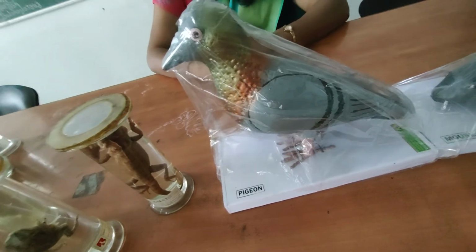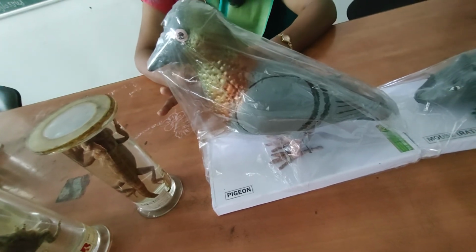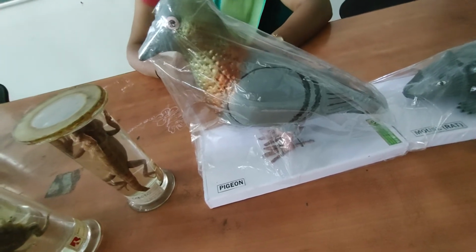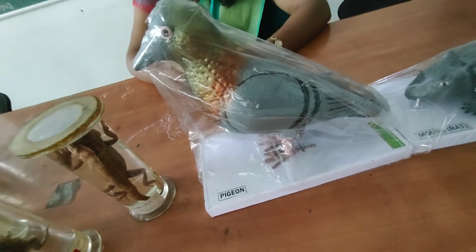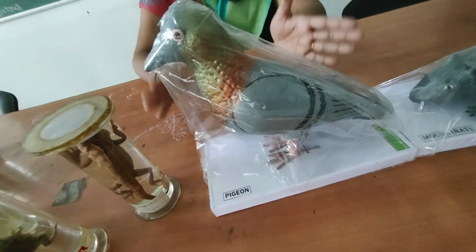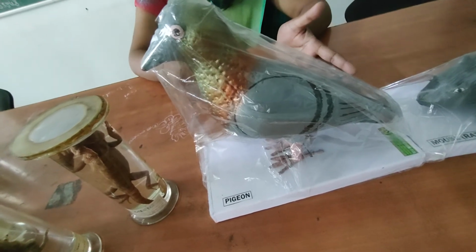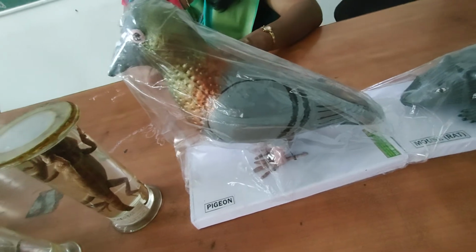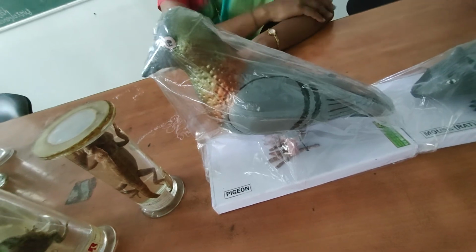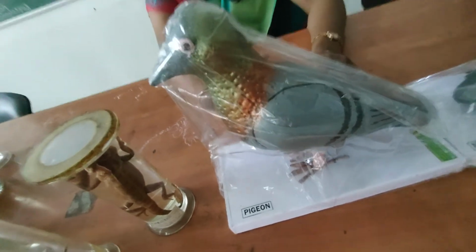The brain is enlarged. They have a well-developed cerebellum for equilibrium, and the optic lobes are also very well developed. Olfactory lobes are poorly developed in birds. Sexes are separate, so they show prominent sexual dimorphism. They are oviparous, they lay eggs, and the egg has yolk and albumin. Fertilization is internal. This pigeon is an example of a bird in front of you.